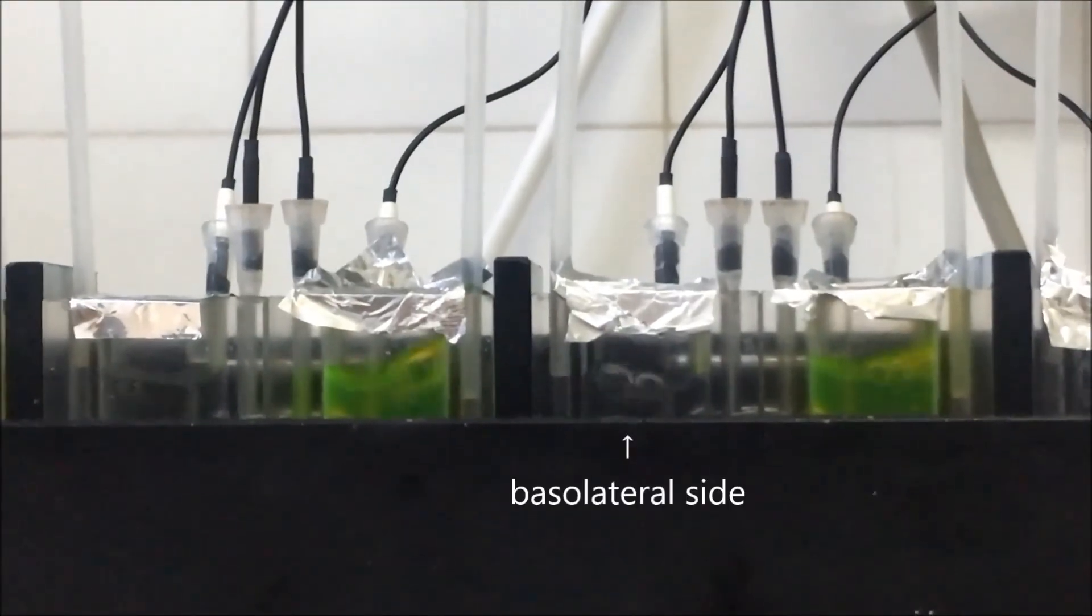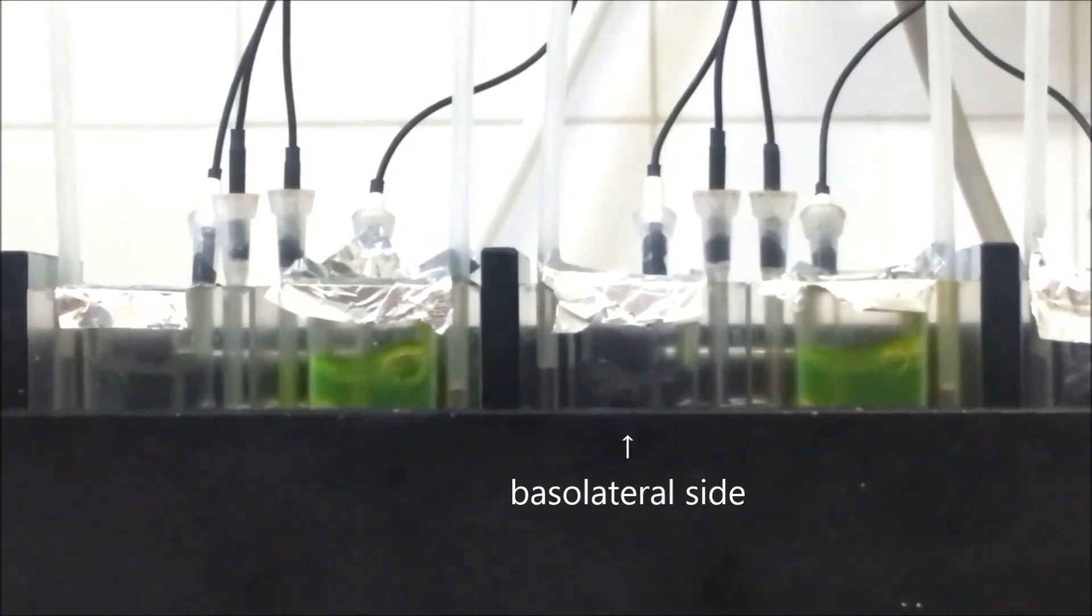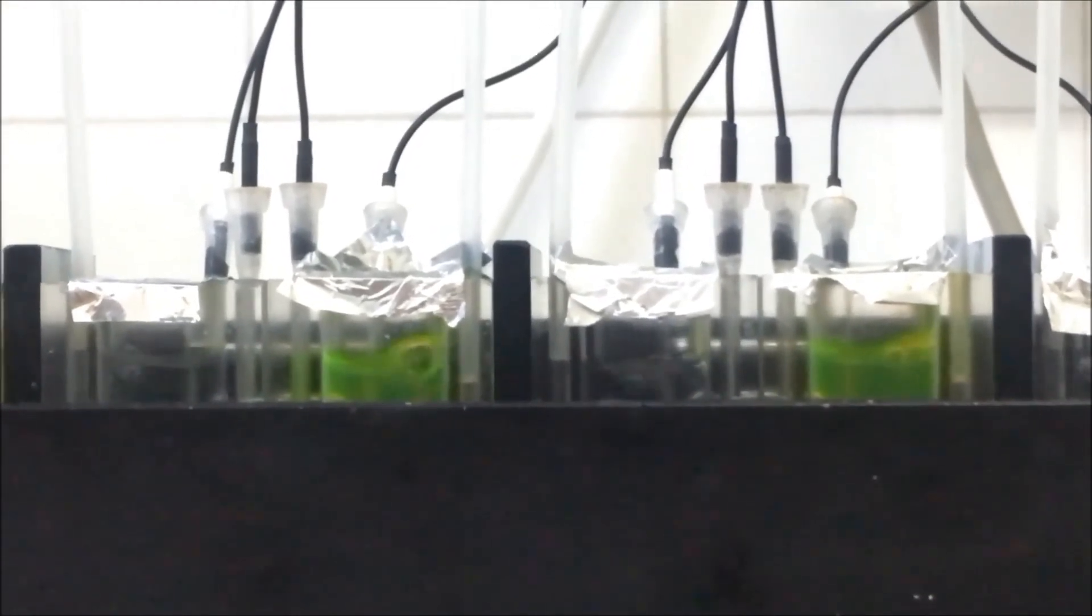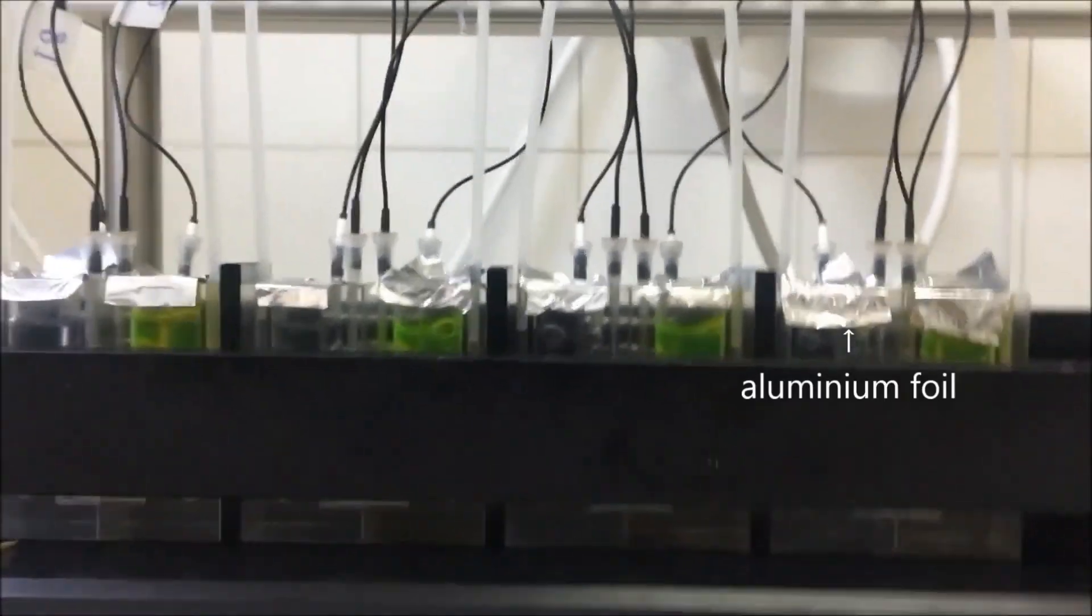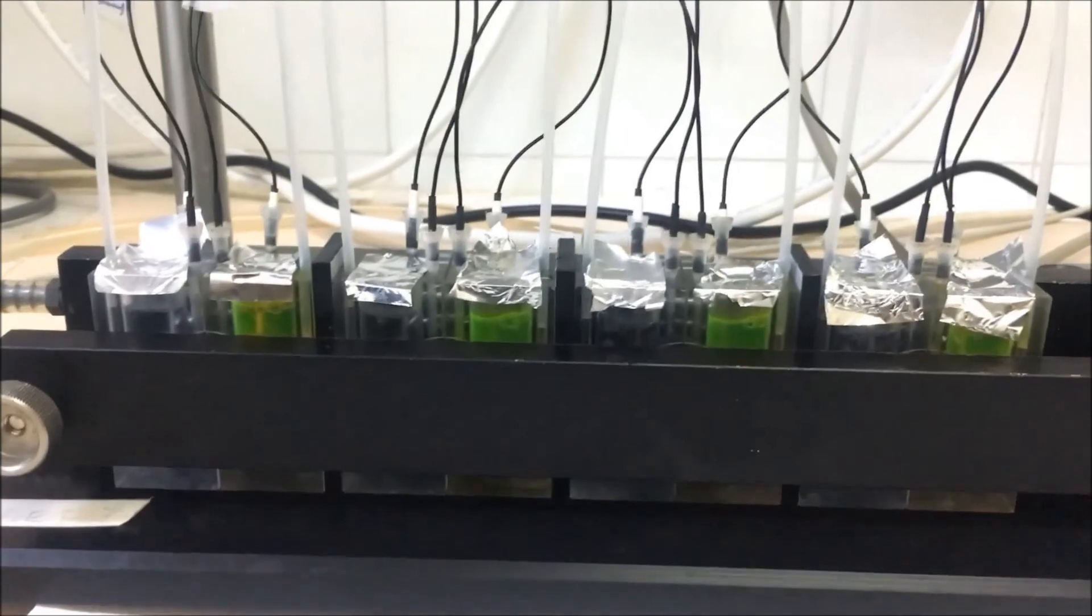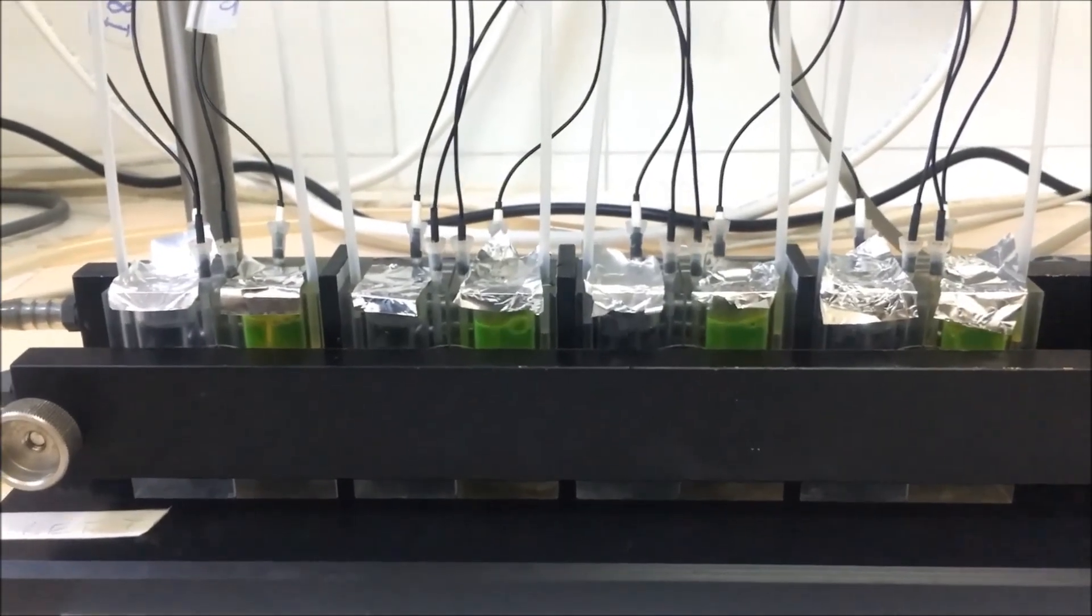Collect samples from the basolateral side within 2 hours in every 30 minutes. Replace with the same amount of Ringer as the samples every 30 minutes. We cover the top side of the chambers with aluminum foil to avoid fluorescein contamination to the basolateral side.